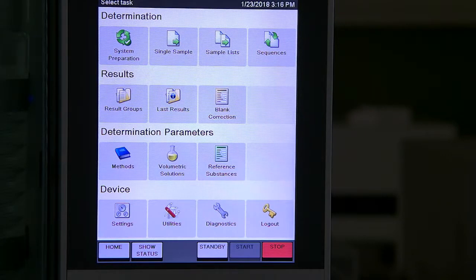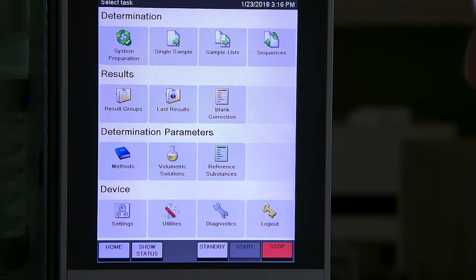Let's take a look at a couple of sensors on our K375 that are related to safety and that can tell you quite a bit.